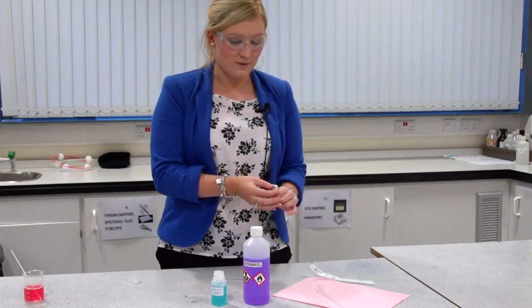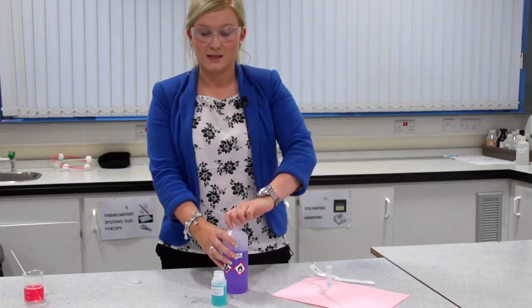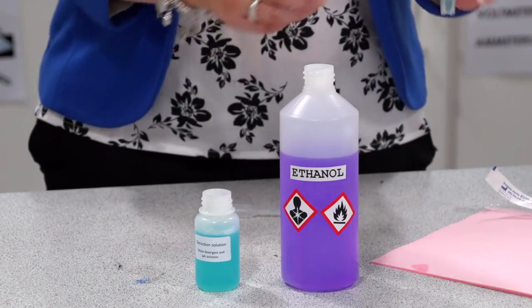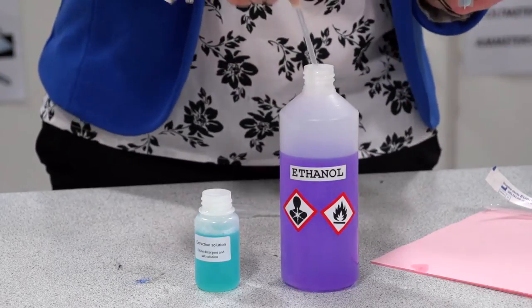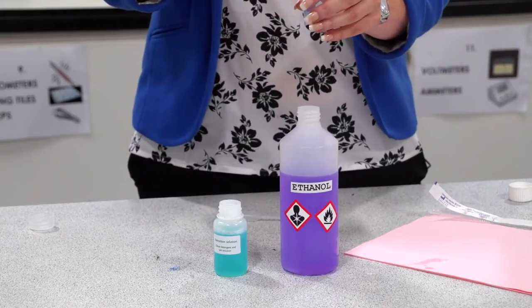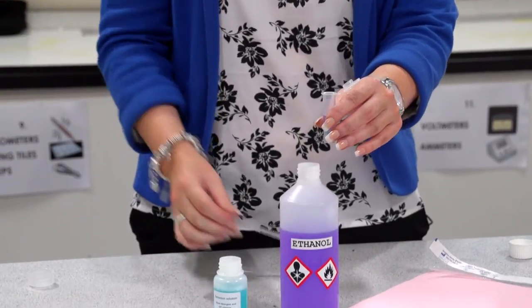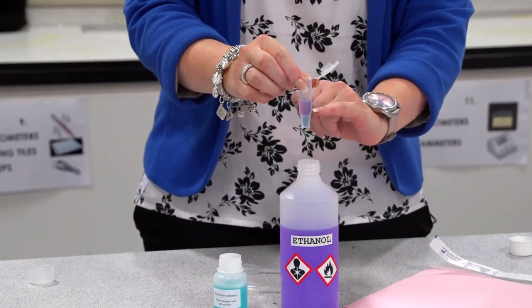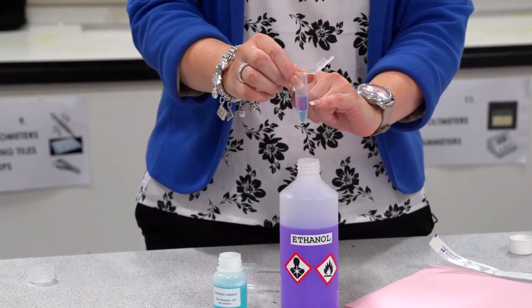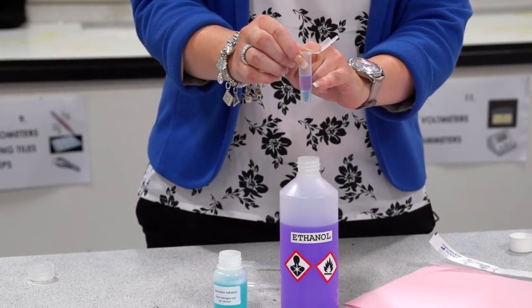Next, measure two millilitres of the ice-cold purple ethanol and slowly run it down the inside of your vial. Use a fresh syringe to do so, just to prevent contamination. Slowly drop it down the side of your vial and you should see two layers forming — the blue layer is the extraction solution and the ice-cold ethanol on top. What you should see rising from the blue layer is strands of DNA from your cheek cells.